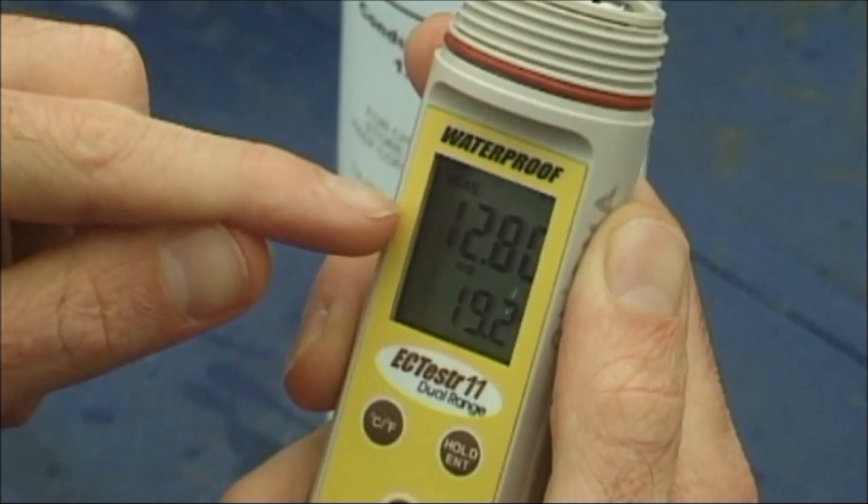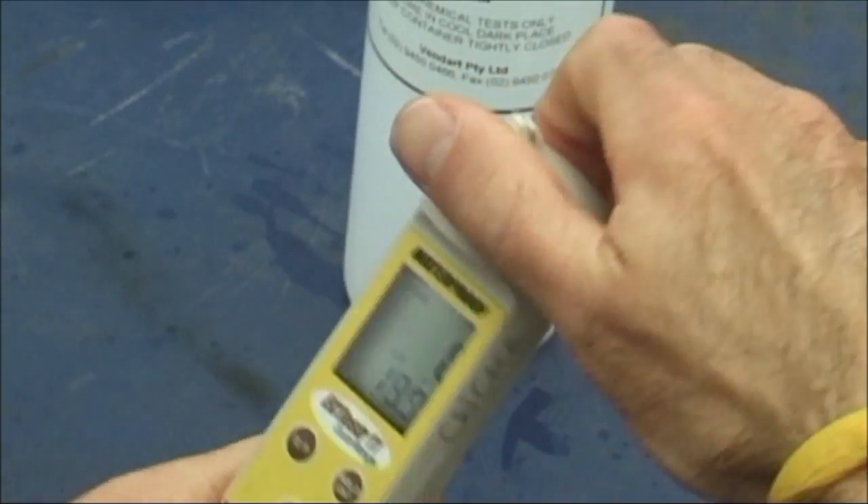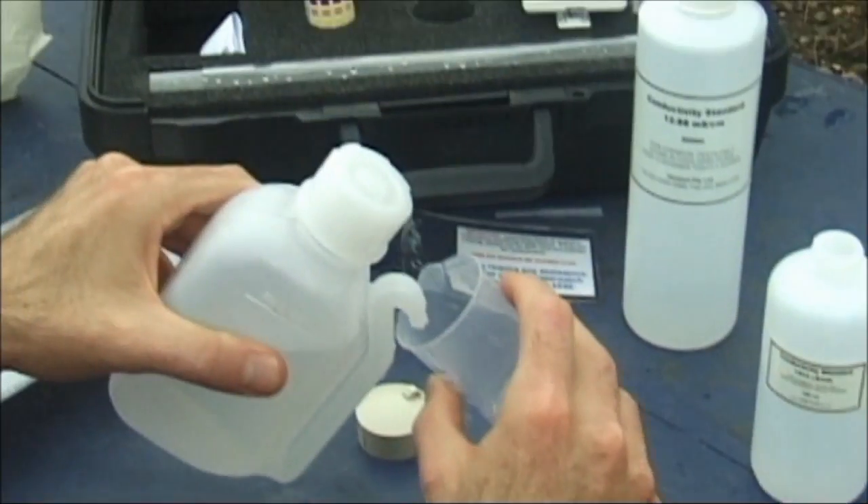The meter is now calibrated. Replace the cap. Turn the meter off. And clean all the equipment with deionised water.